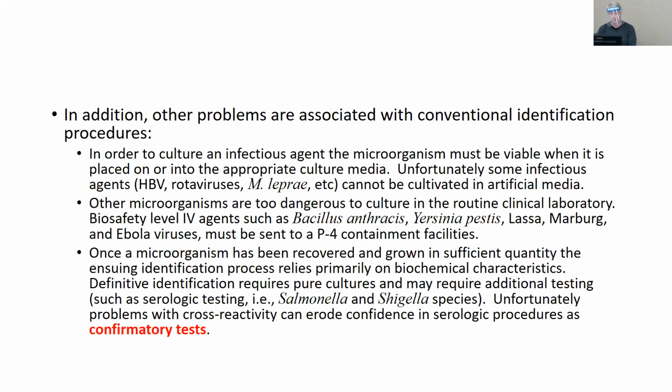Other microorganisms have to be recovered and grown in sufficient quantities to ensure ID. Definitive ID requires pure cultures and may have additional testing. So we may have more than one organism. You've got experience with that now. Y'all have opened up some plates and go, ooh. Right? That's what we do when we go, ooh.